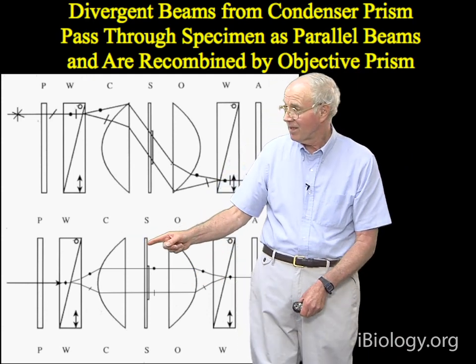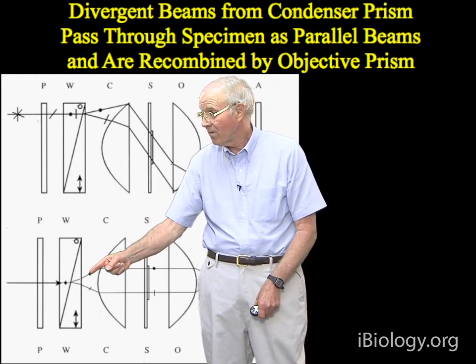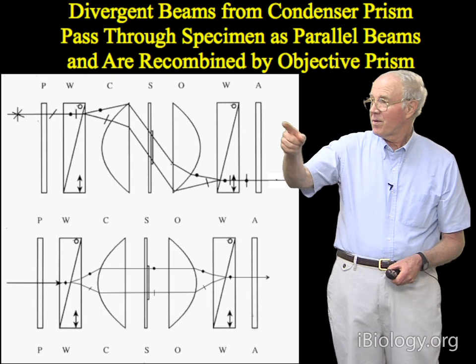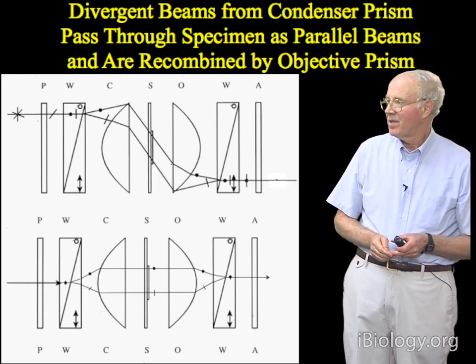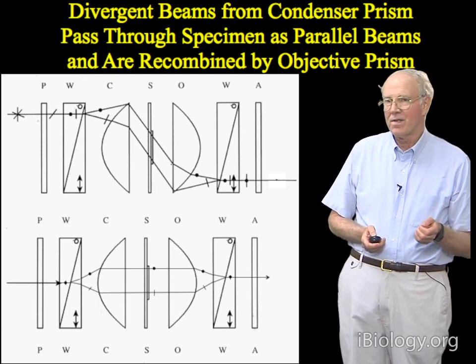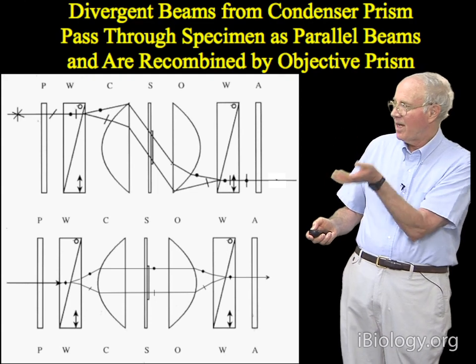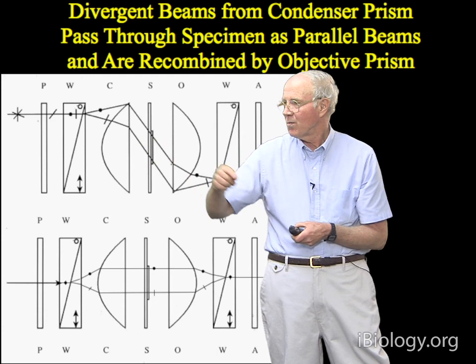So you can see that the dot here for this wavefront and the bar here for that wavefront are right in line with each other. But if we go to the top of the prism, because the lower prism is thicker than the higher prism, then one wave gets way behind the other wave, right? You'd have the same sort of drawing, but equal and opposite, for the other side of the prism. But I only drew just one of these.